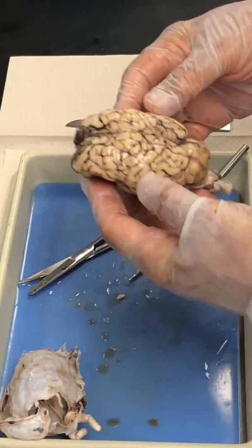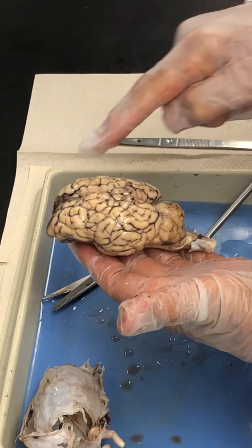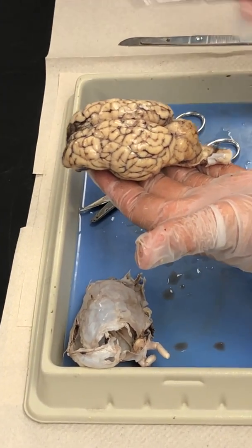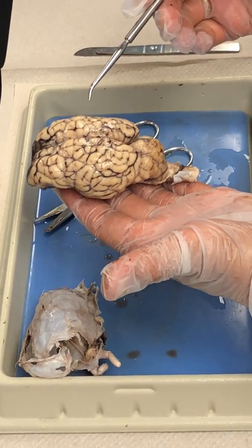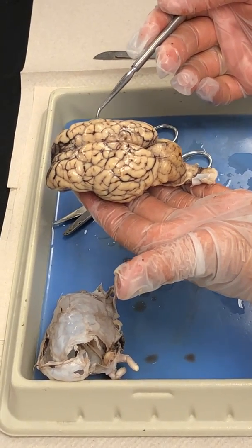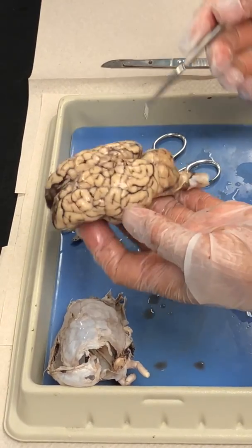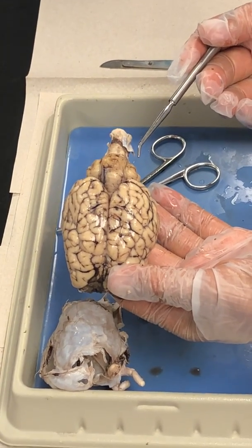Anyways, so then what you can do is you can take the brain and look at it from the dorsal side. Again, this whole thing on the top in here, that's the cerebrum. That is the cerebellum. And when you look at the cerebrum, you can see all the black in there. Those are the blood vessels that cover the whole cerebrum. And then you can see the elevated areas. These are your gyri. And then the depressions, or the grooves in there, those are your sulci.